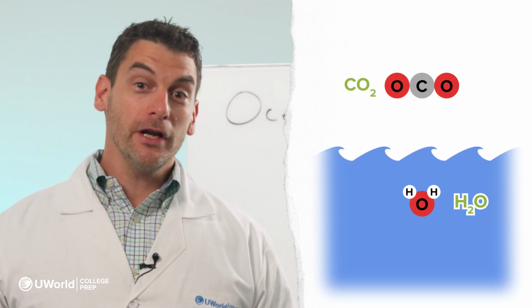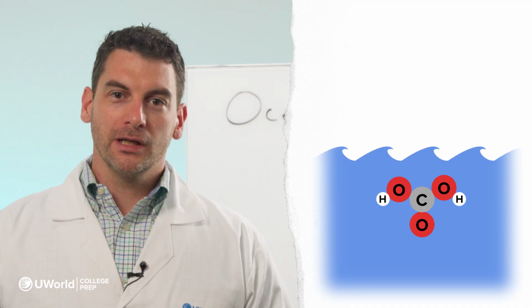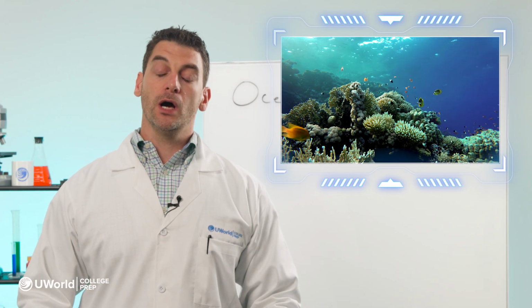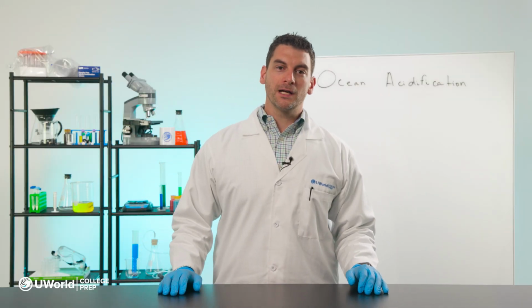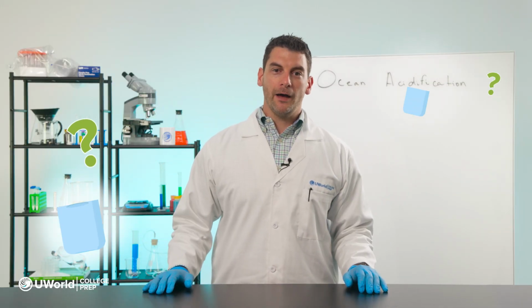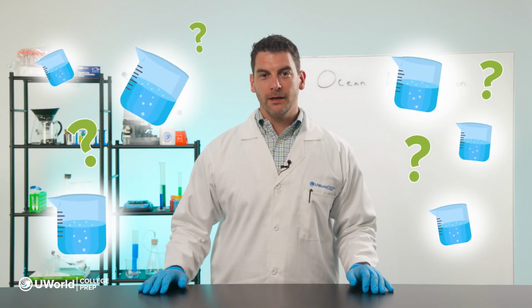Every day, 30 million metric tons of carbon dioxide dissolves into the world's ocean. This is changing the chemistry of seawater and threatening marine ecosystems. Today, we'll recreate this process in our very own UWorld lab and see how various water samples are affected by carbon dioxide. This topic is a major part of your AP Environmental Science course, so stay tuned to learn the science behind it.